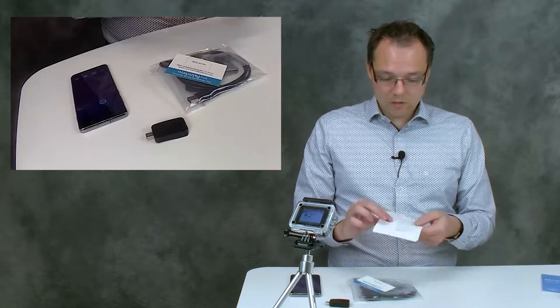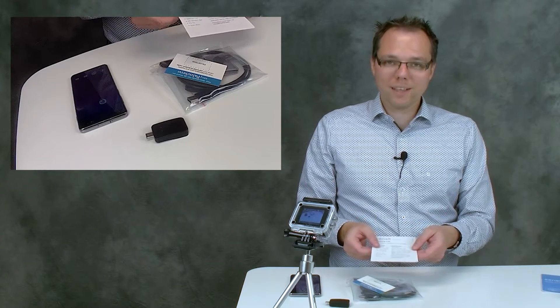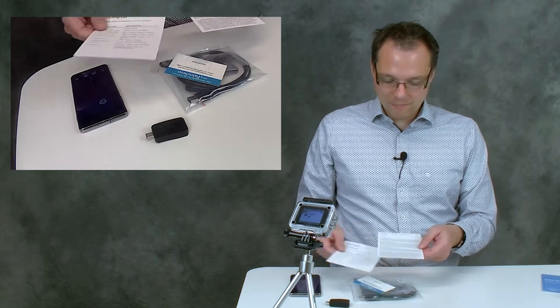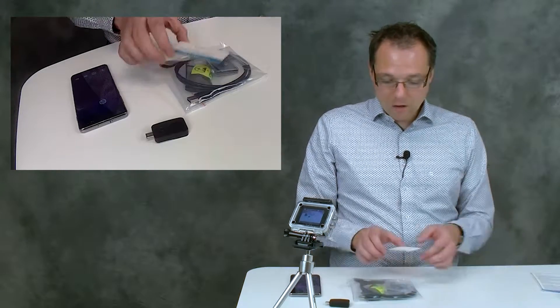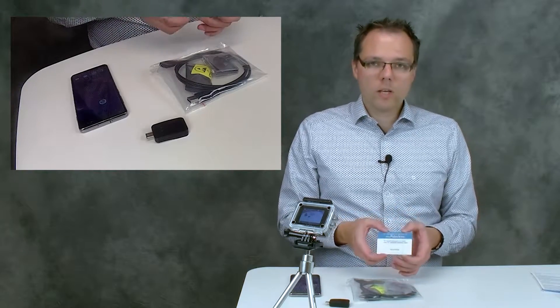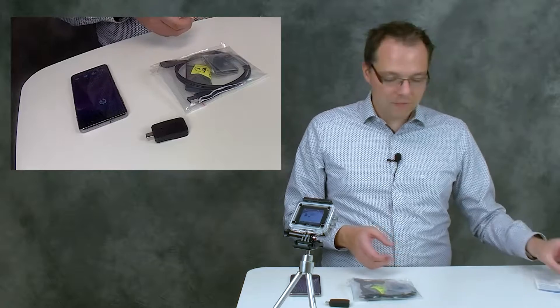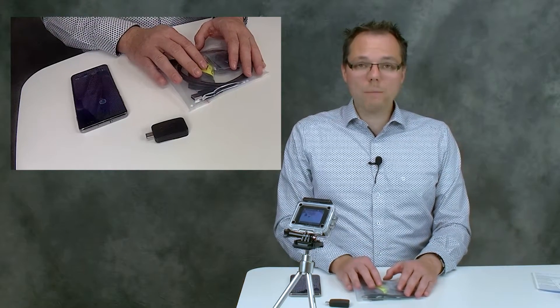If you're really into reading, you can also read the list of contents of the package—what should be in there—and your warranty terms and conditions. Also, you find in there an activation code. You can use that for downloading the software PS Trace, for example, on our website.